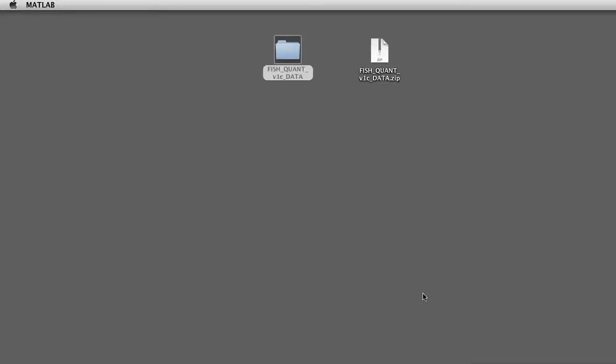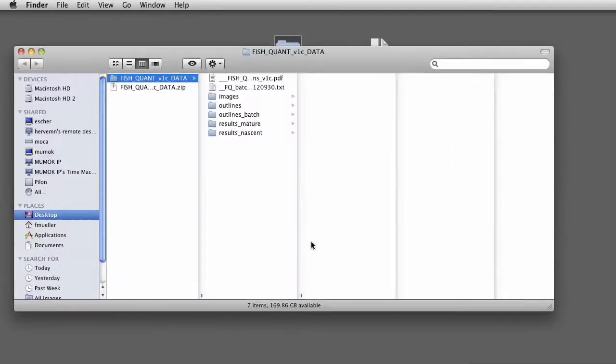Hi, this is Florian. In this video I would like to give you a brief overview of the test data you can find for FISH-QUANT and how to use it. You can find the test data set on the website. You can download it. It's a simple zip archive. I already unzipped it and it contains a folder.